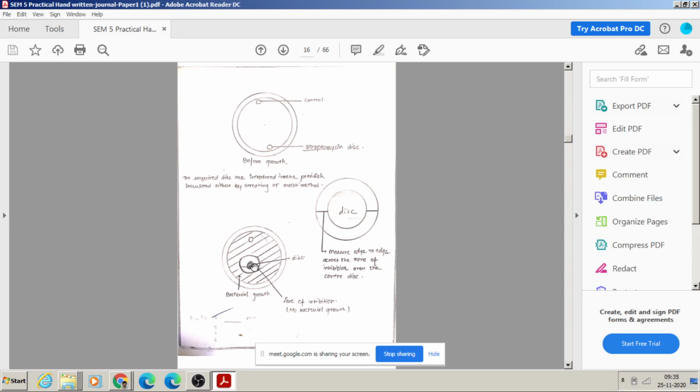So the compound does have activity, but the concentration we can decide. During your research you have to prepare various concentrations, and from those find the concentration that gives the best result, that is, the maximum distance.